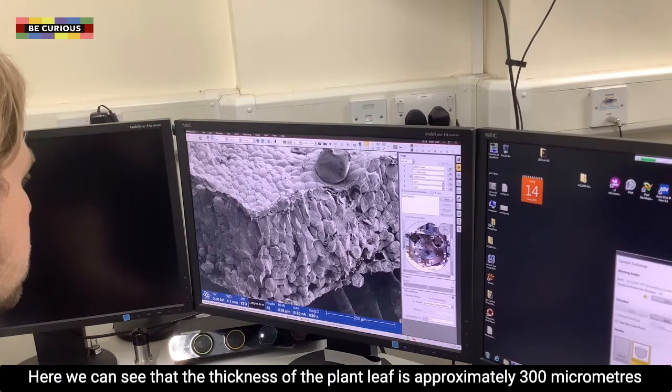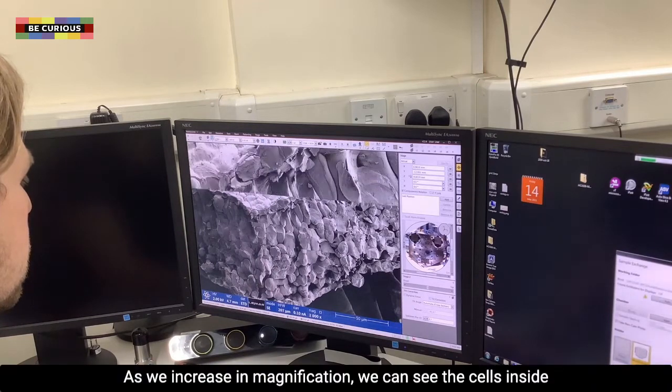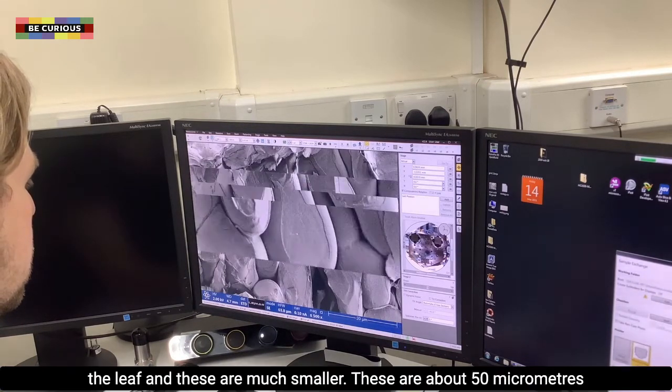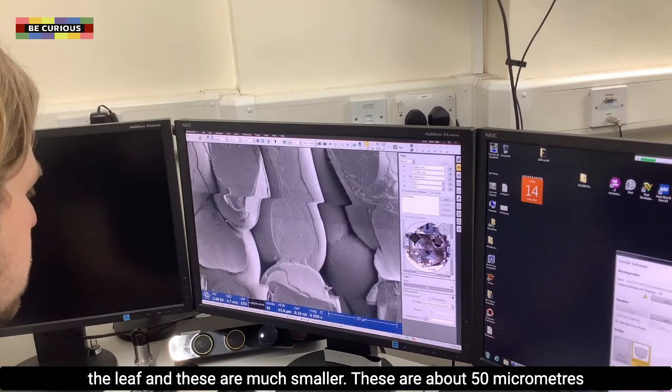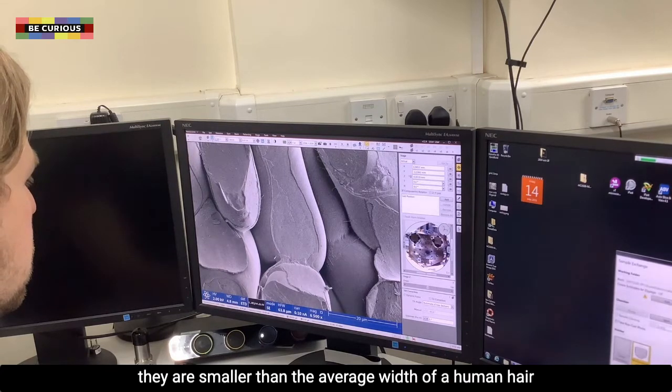Here we can see that the thickness of the plant leaf is approximately 300 micrometres, which is three one thousandths of a metre. As we increase in magnification we can see the cells inside the leaf, and these are much smaller. These are about 50 micrometres long, which means that in length they are smaller than the average width of a human hair.